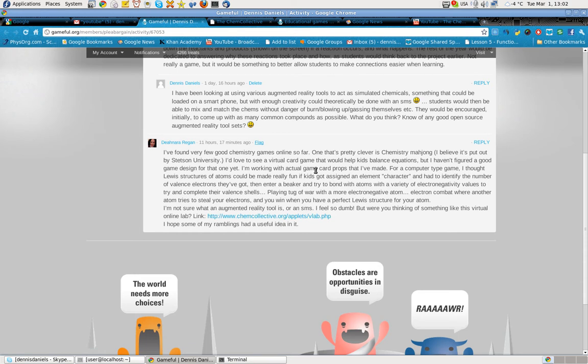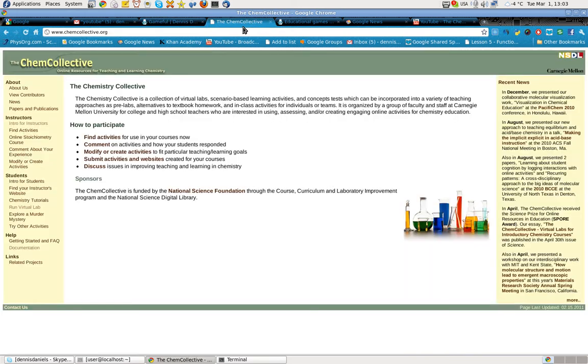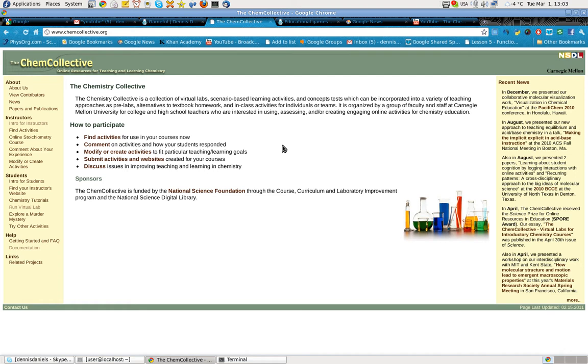I went ahead and checked Chemistry Mahjong, but we'll go to that maybe later. Chem Collective, here it is. Chemistry Collective, Carnegie Mellon National Science Defense League, or National Science Digital Library, National Science Foundation.